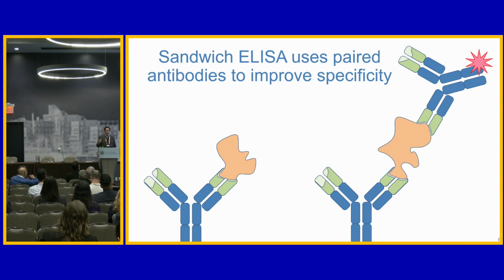And that secondary protein will have a reporter. You'll read out the reporter as a way to say how much of this protein is actually present in this arrangement. So again, we're getting around needing to use a molecular weight, running a gel, because gels are annoying. And we're using a secondary antibody as an alternative, right?